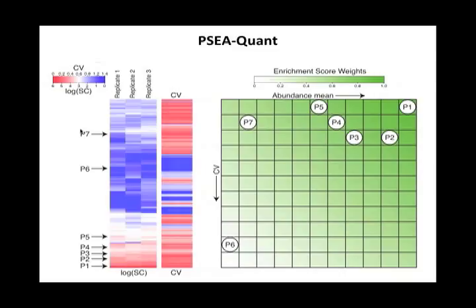But it also allows the relative quantification analysis, where we have two data sets of different conditions that are compared, and so for each protein, we have some sort of abundance ratio. This can be done either through a label-free strategy or using some isotopic labeling.